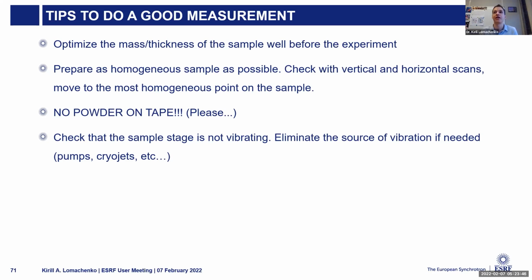And these effects, you can see them even at relatively high energy. So we saw it at 10 keV, 9 keV for copper. So high temperature kills your EXAFS completely. When you install a jet of laminar flow around the cell, data become much better. So when you use high temperature cells, pay attention to this.